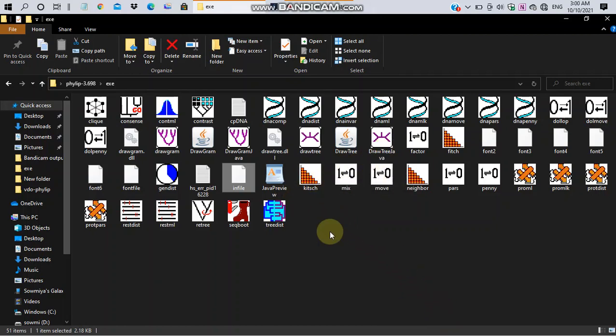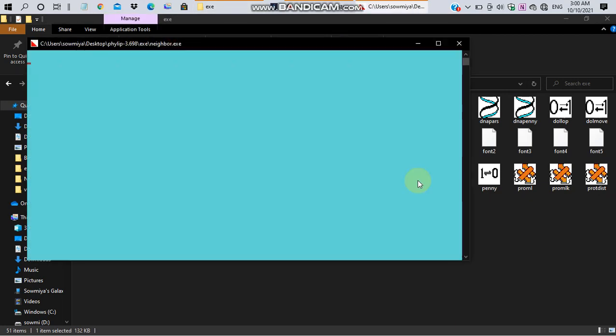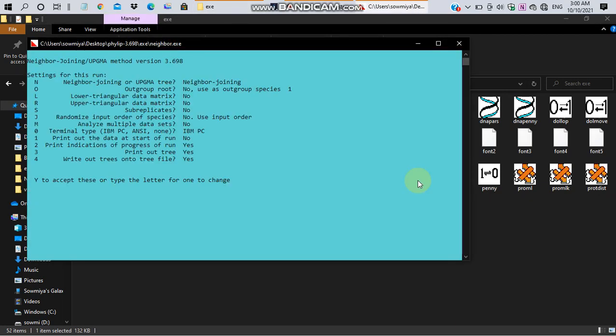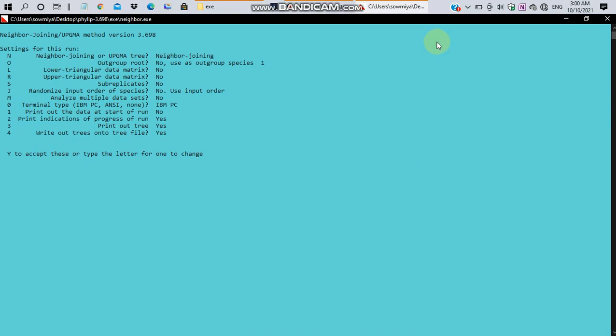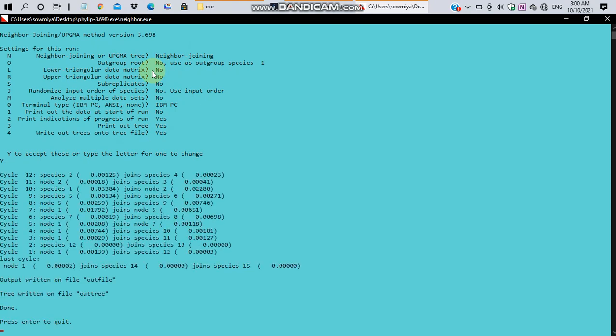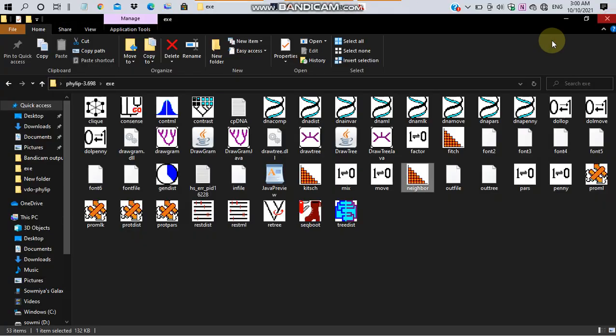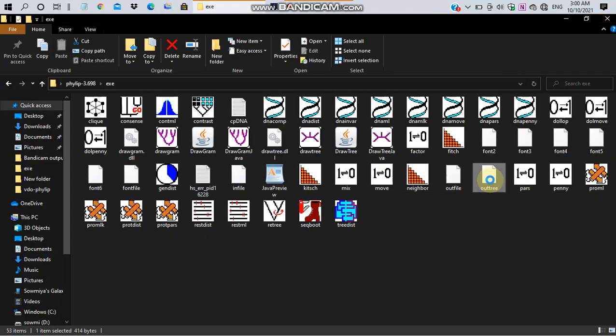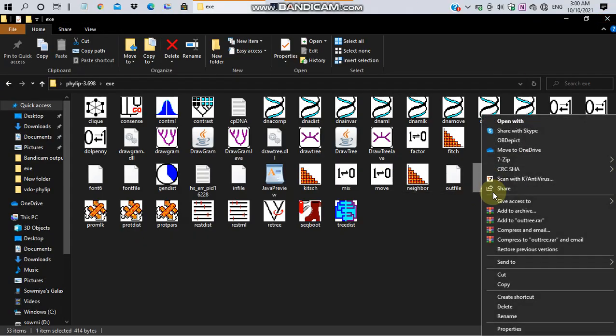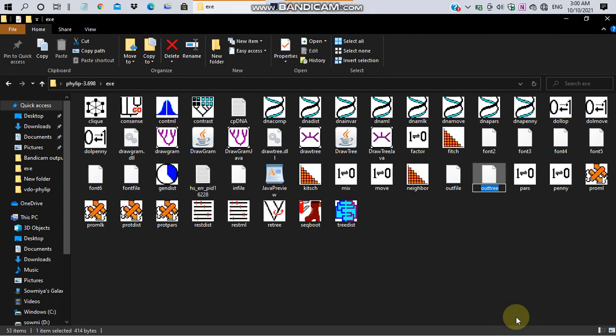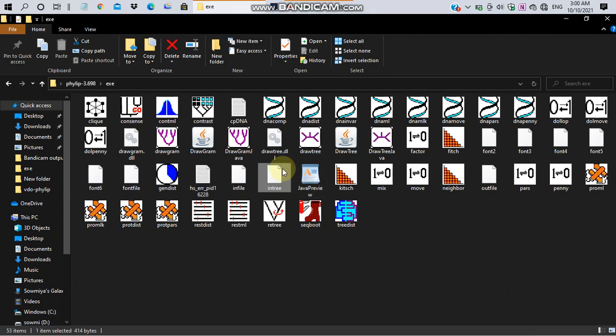It will become the input for the next step. After renaming, click open neighbor. It will take the infile as input automatically and load the parameters for tree construction. Enter y to accept this parameter. This will generate both outfile and outtree. Just rename outtree as intree. The intree is used for tree construction.